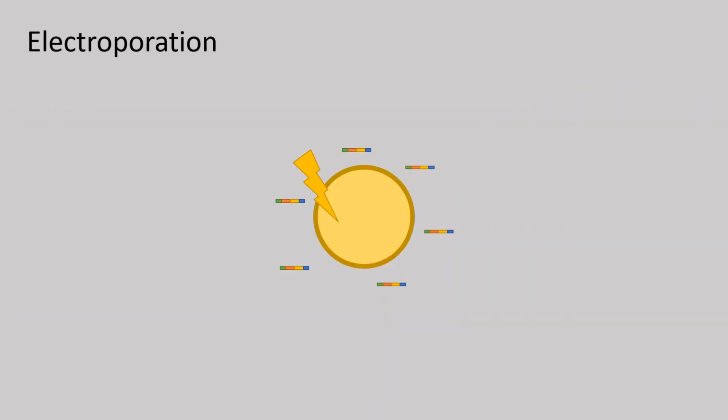Electroporation is the use of electricity for the purpose of genetically transforming an organism. Cells and DNA constructs are put in a suspension that conducts well. Then short electric pulses are sent through the suspension. These pulses will fragilize the membrane of the cell, creating pores through which the DNA constructs can enter the cell.